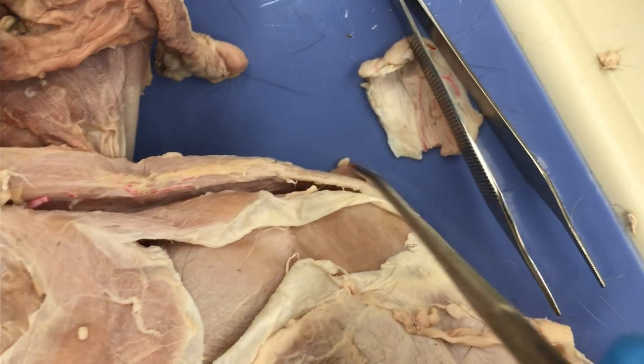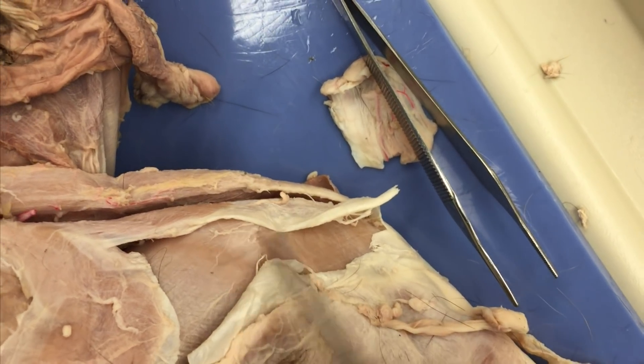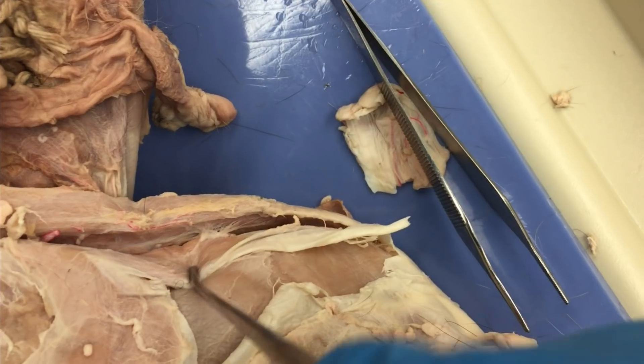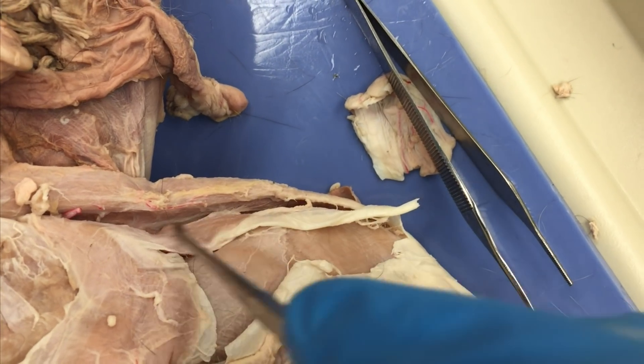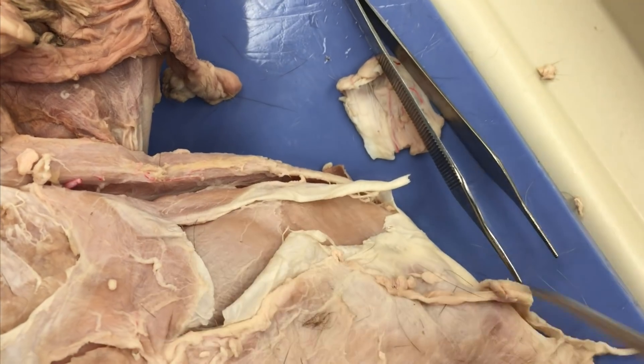Right here I've cut some of this fascia off. This is covering the vastus lateralis, and it's connected to a smaller muscle here — that's your TFL, your tensor fascia latae.